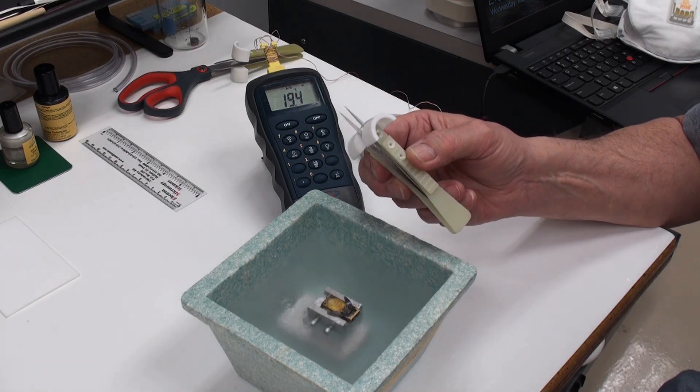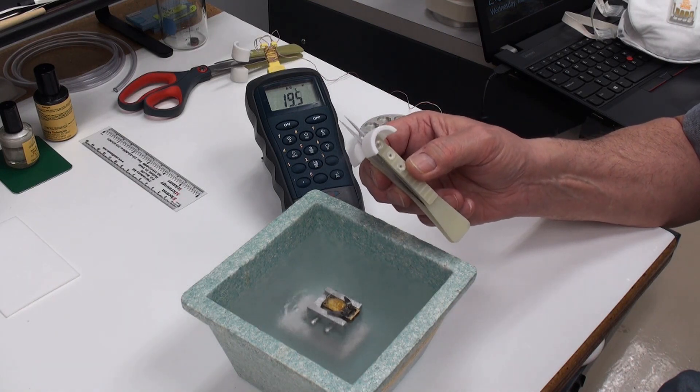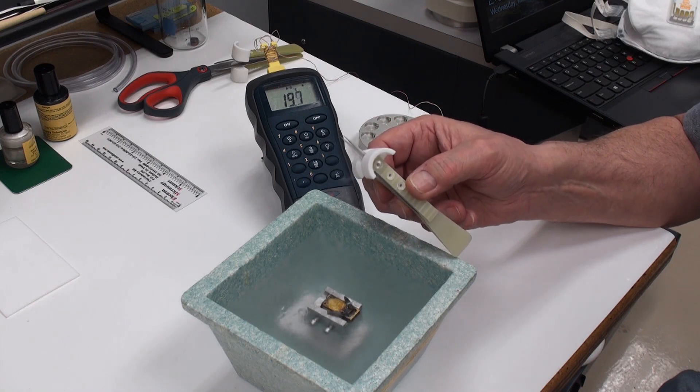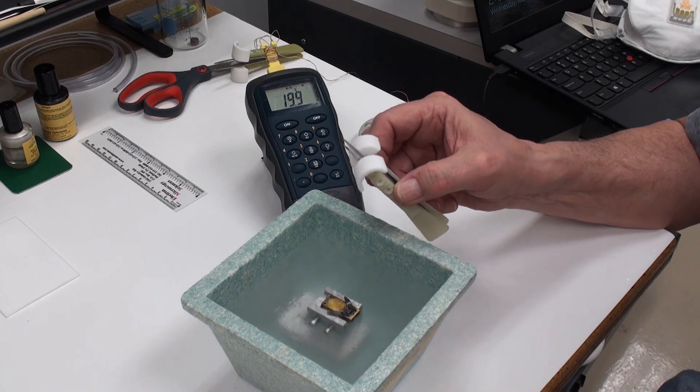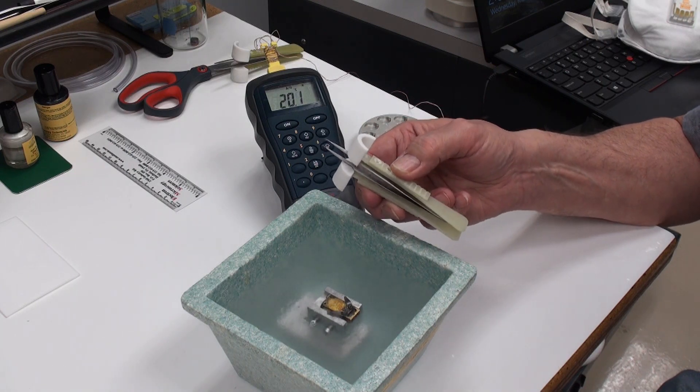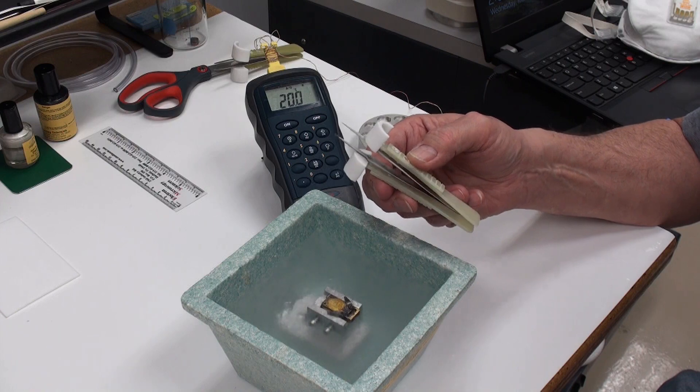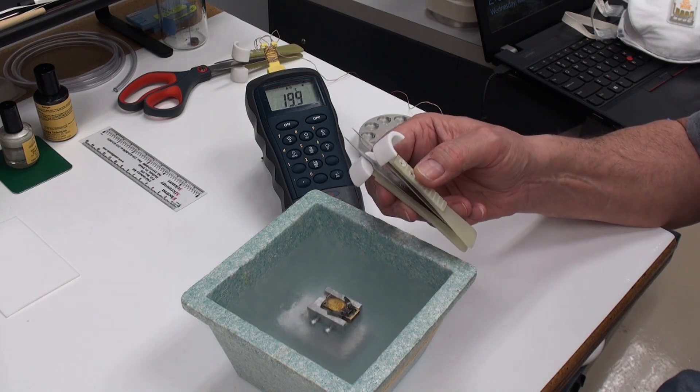And then further along down the road, I hope to just have a program where you send in your bent forceps and we'll do the replacement for the cost of the tweezer and a nominal fee.